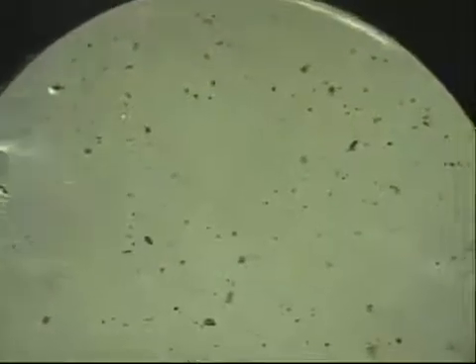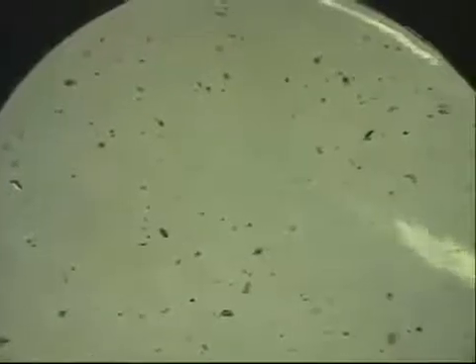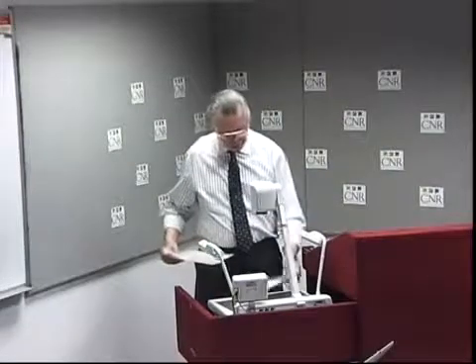There we go. This is a typical handsheet that was produced on the Pulmac. This can be used, as we showed you before, in the image analysis to count all of the stickies. The laminator is used to heat the stickies and produce another sheet that is from the process. This contains only those materials that stuck to the laminator. You can place this directly on the scanner and measure it just like we did the wet hand sheet.